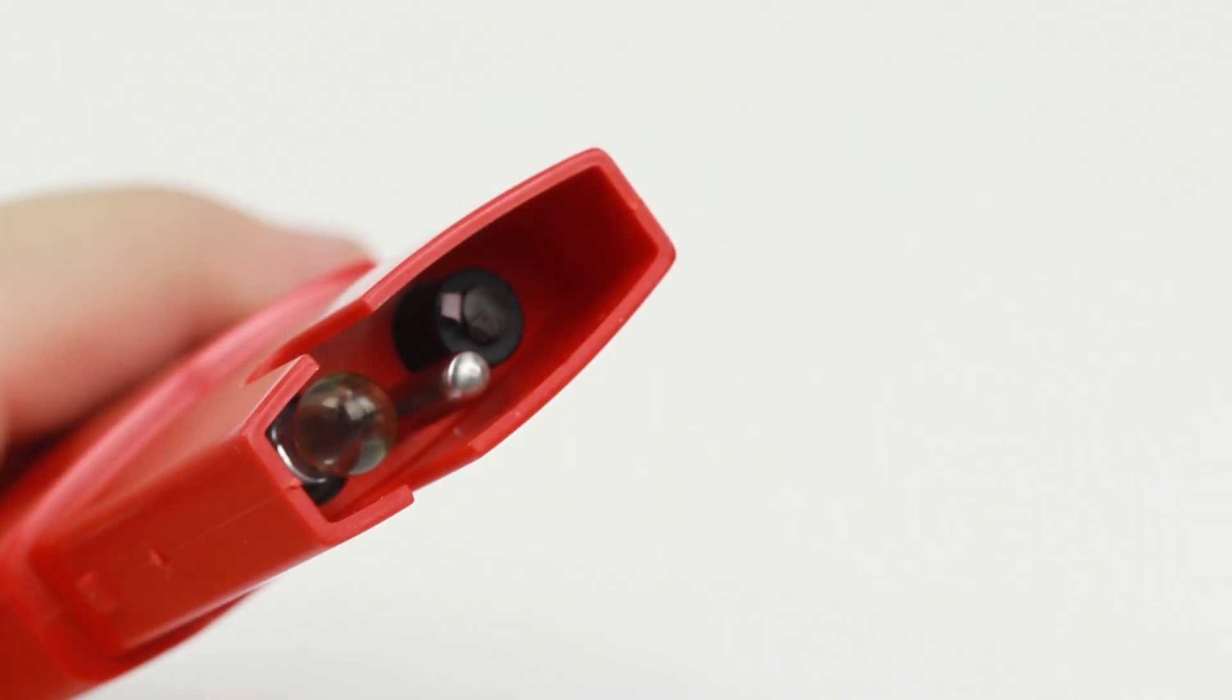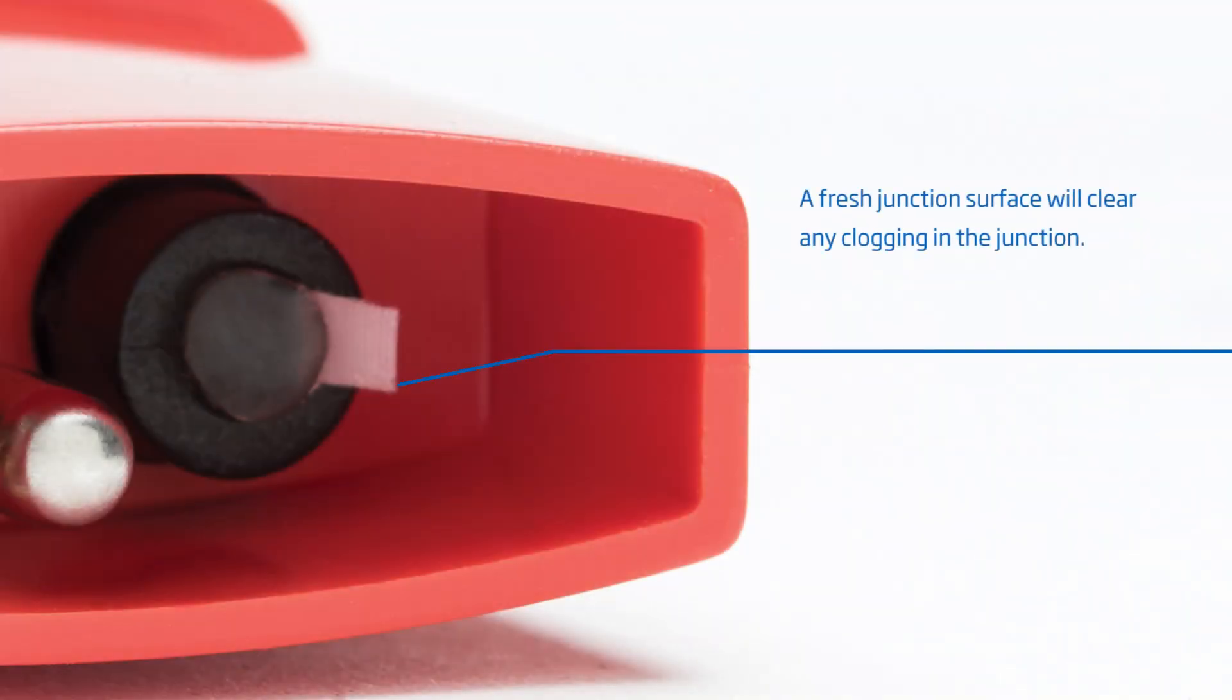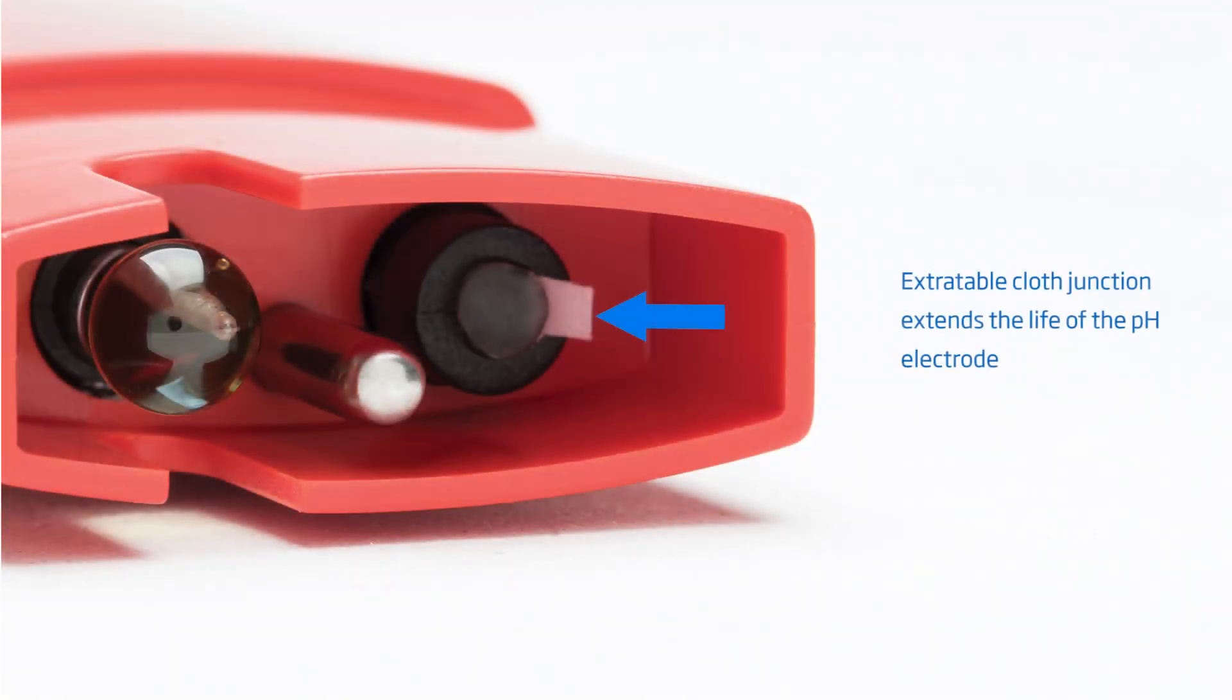Looking at the sensor portion of the meter, the pH electrode, temperature probe, and cloth reference junction can be seen. The cloth reference junction is extractable. When there is a stability issue with the readings, the junction is pulled one-eighth of an inch from the meter to expose a fresh surface. The extractable cloth junction offers a great benefit in extending the life of the pH electrode.